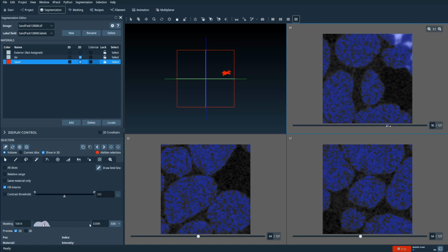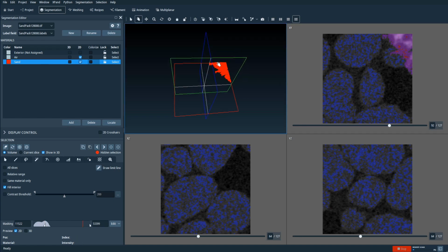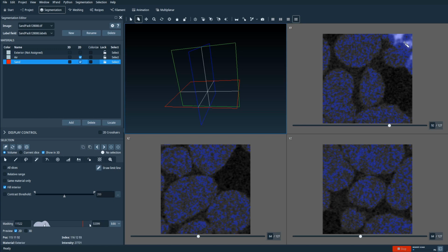And let's look for a more interesting example. So let's say here that I see there's this region here with high intensity pixel values. And what I can do is click here, and this selects the region there. So let's clear our selection first and redo that so that we only get the region here. And so right now it just selects the pixels from one slice with the high intensity values and are connected.